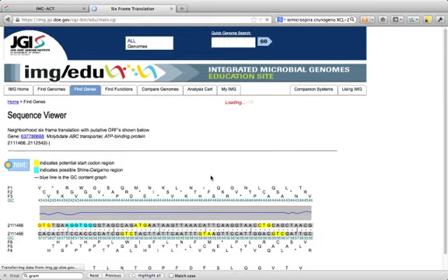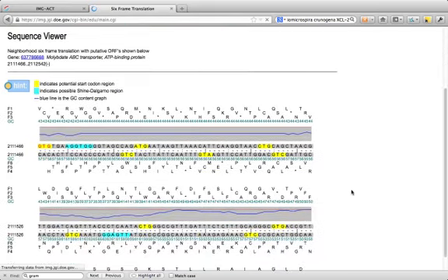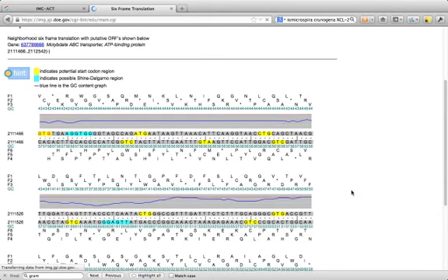We're getting the six reading frame output of this piece of DNA of Thiomicrospira crunogena, and here is the actual start codon with the associated methionine. If you go back 1, 2, 3, 4, 5, 6, 7, 8, 9, we see AGG, TGG.